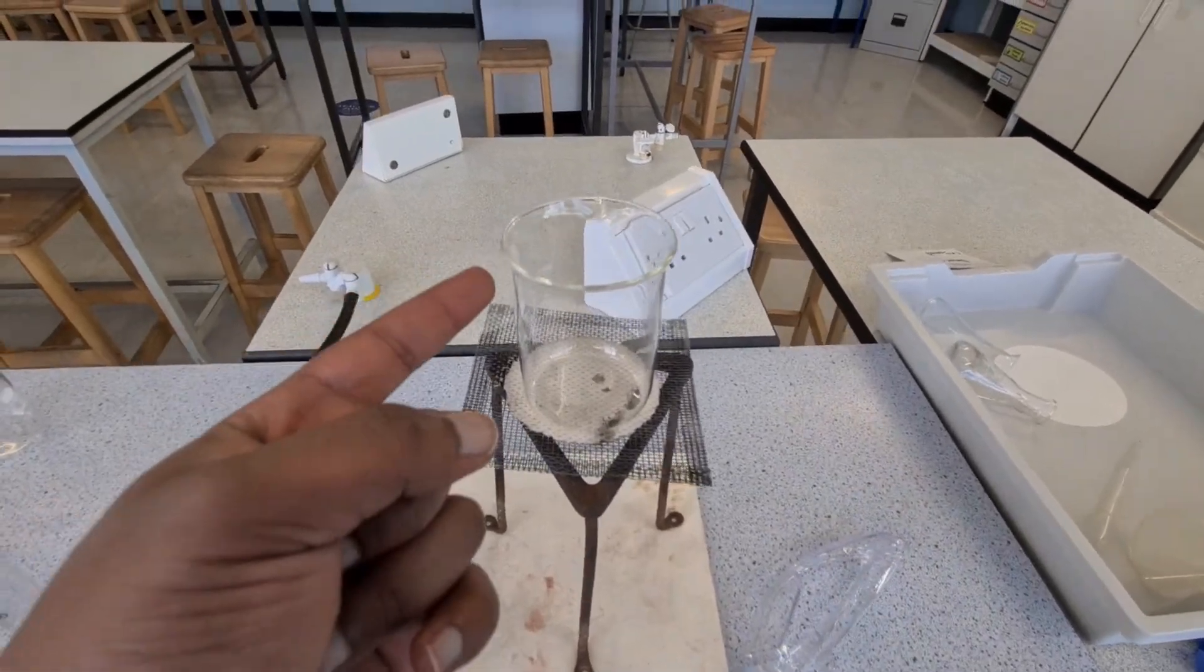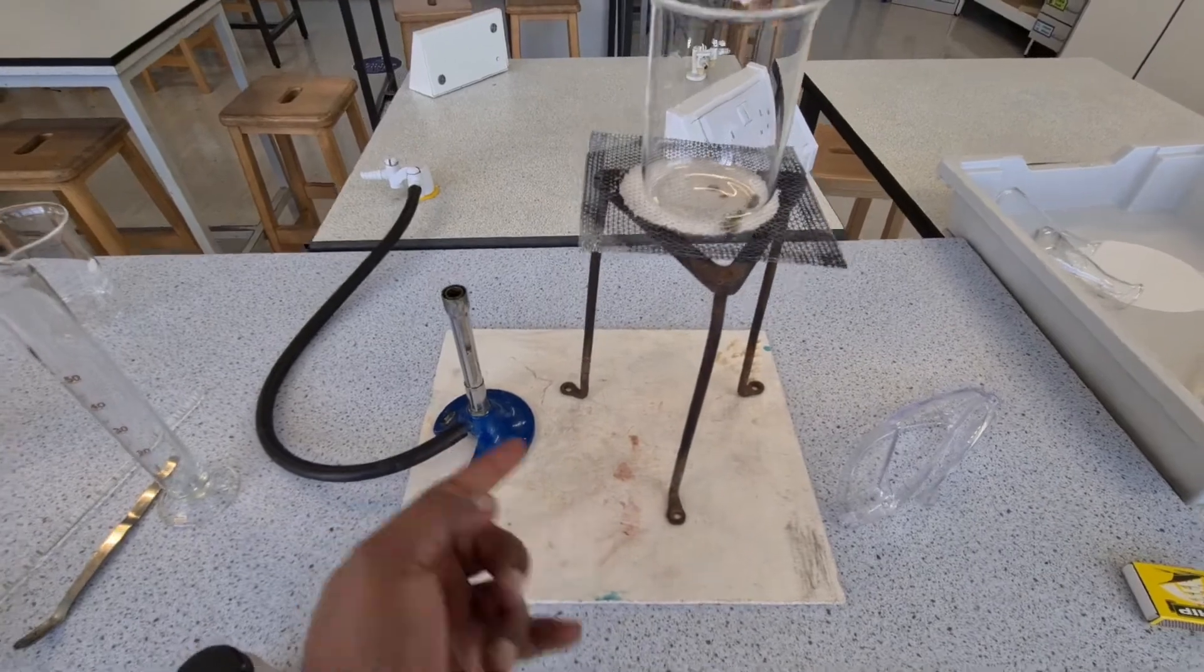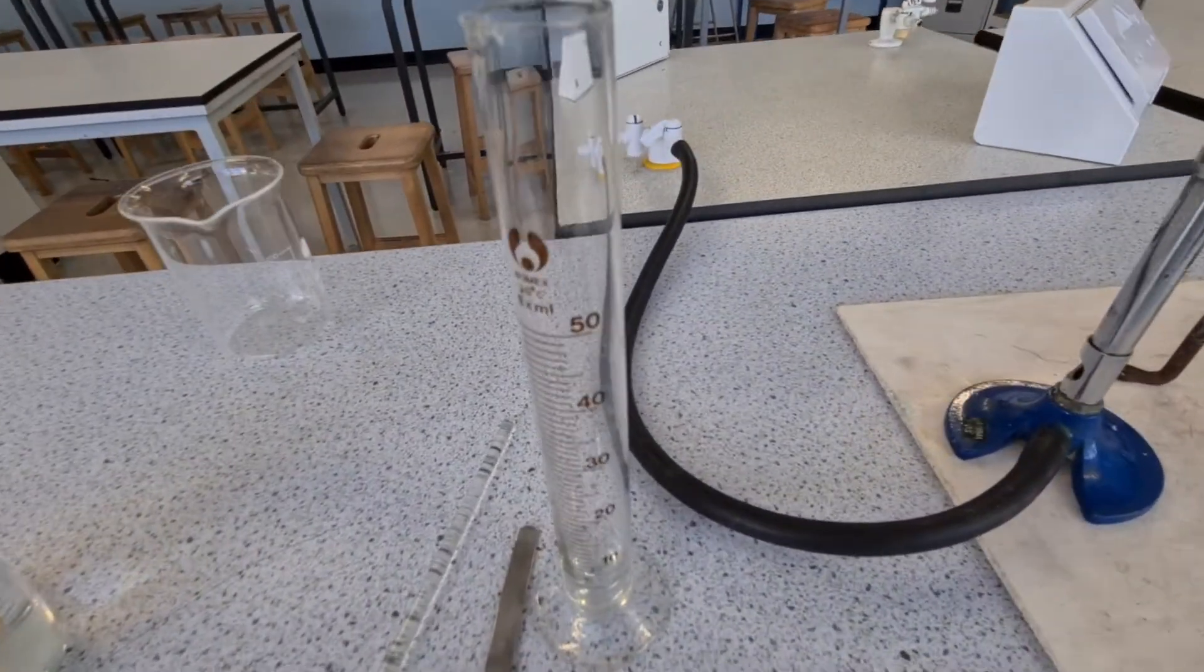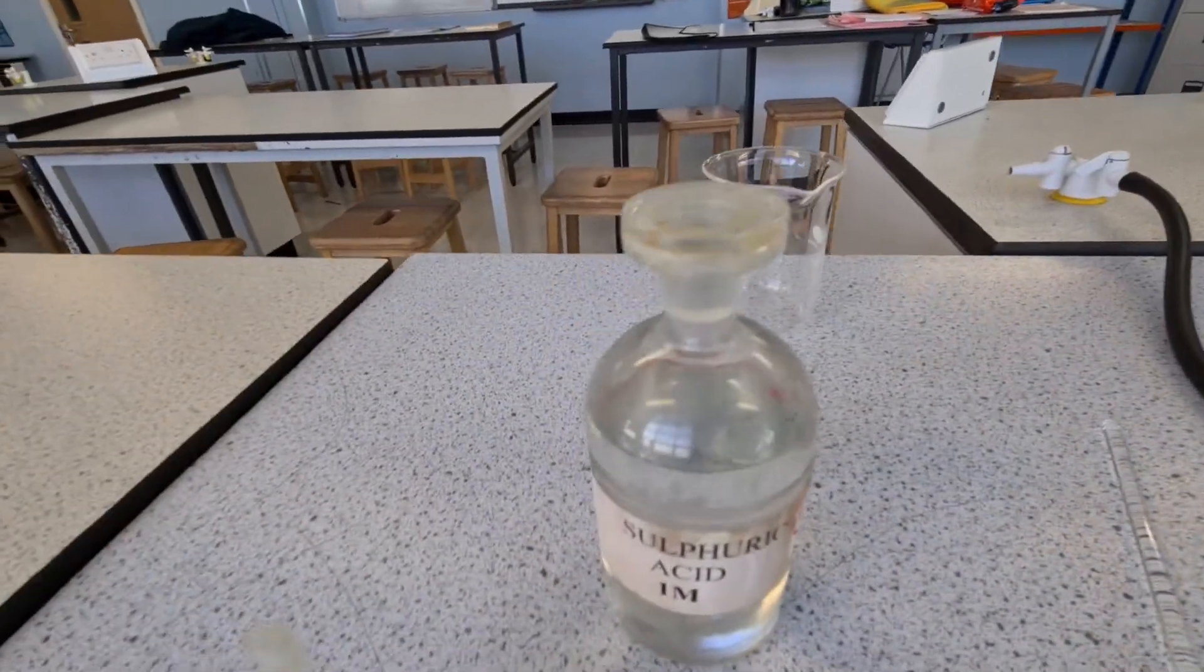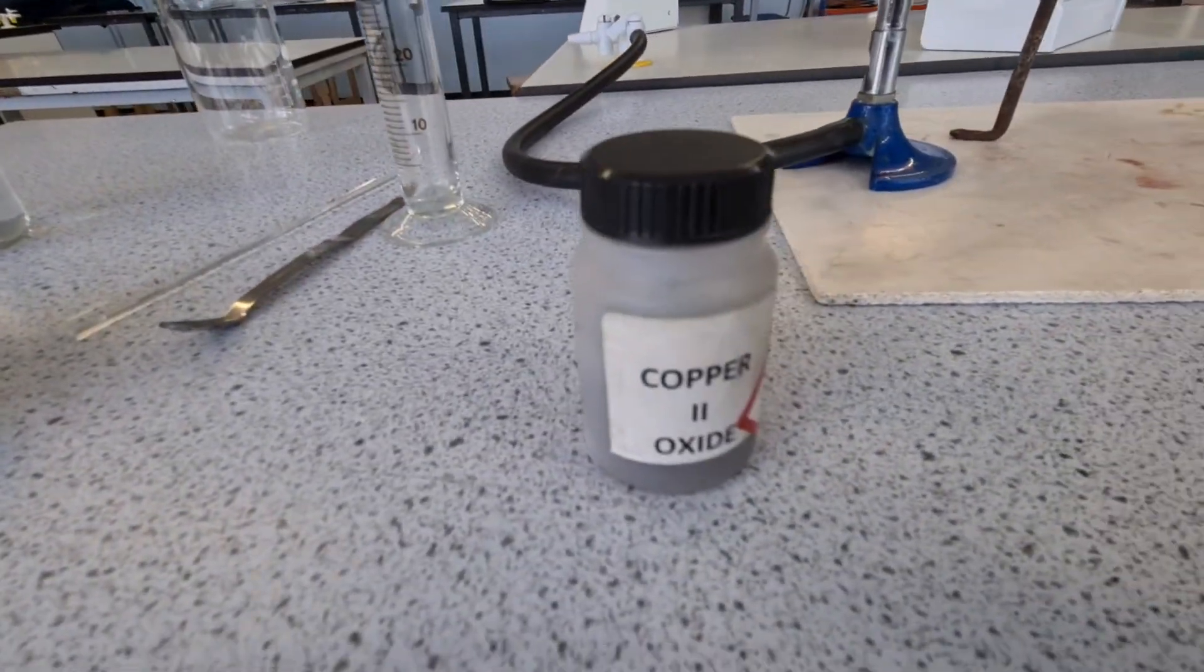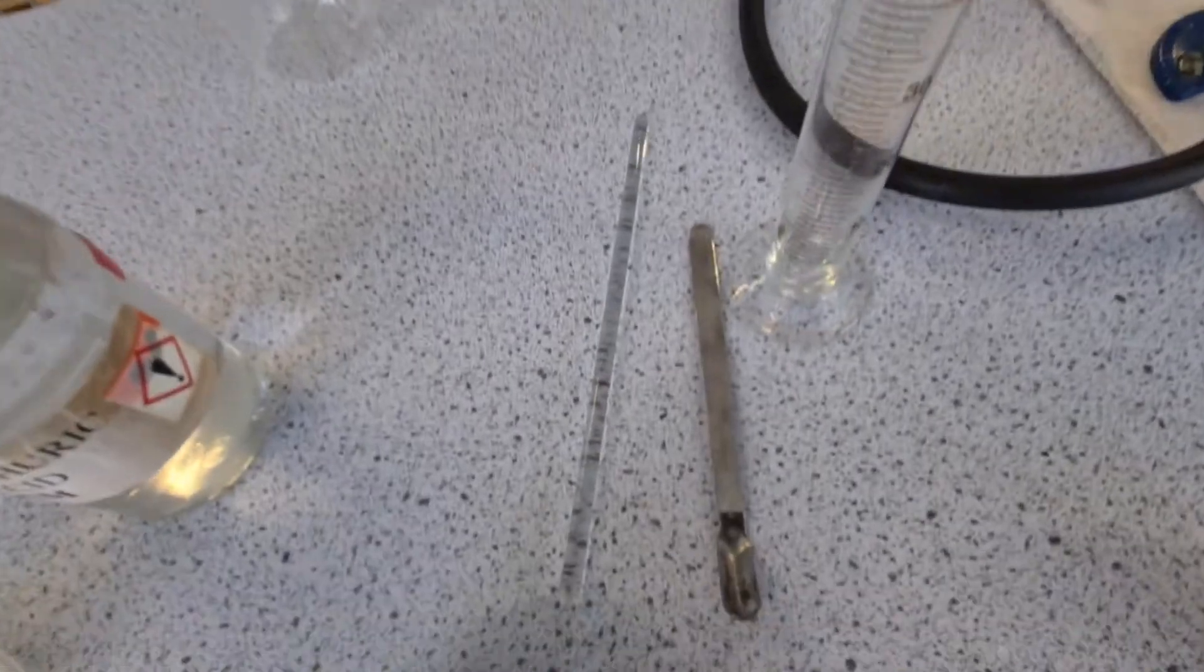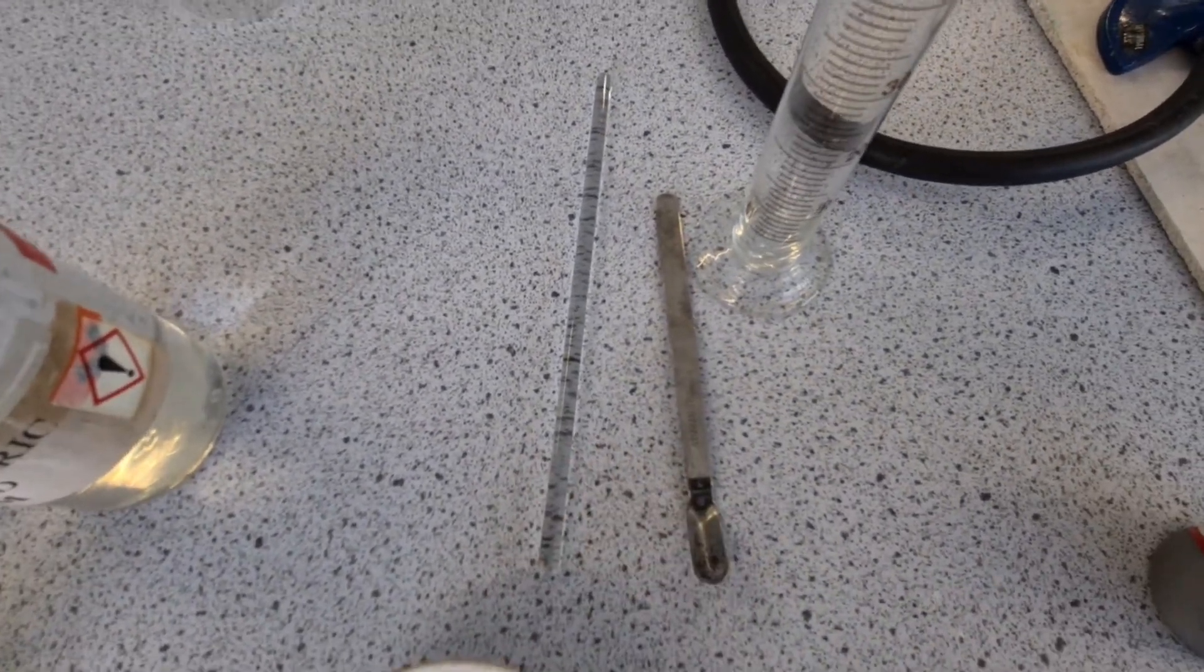Over here I've got my glass beaker, wire gauze, tripod, heatproof mat, and a Bunsen burner set up like this. I've got my measuring cylinder, which can be used to measure the volume of the acid. I've got my insoluble base copper oxide over here. I've also got a stirring rod on the left and a spatula on the right.